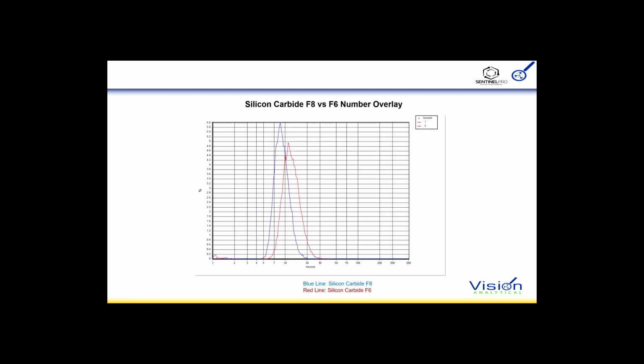F6 shows a greater bias towards the quantity of particles above 20 microns. We see this bias here. That is why it's 44% larger, because of these particles here that are added. It appears the quantity of fines for sample F6, the red one, is different than sample F8. The blue line is pretty uniform, 0, but for F6, the quantity gets larger as the size gets smaller.